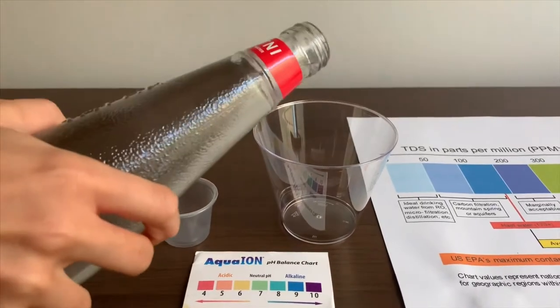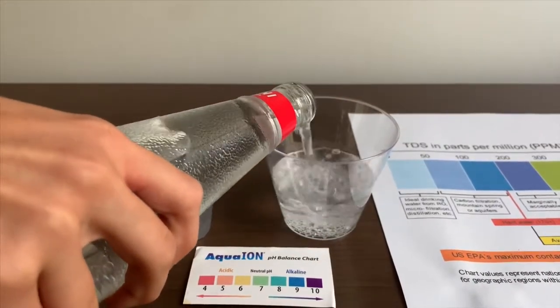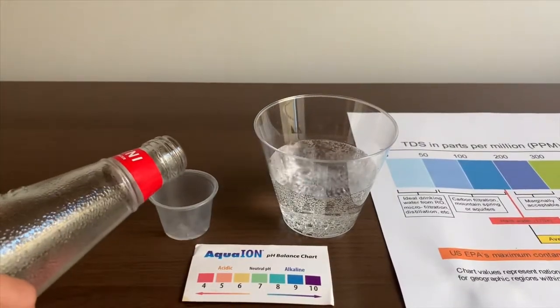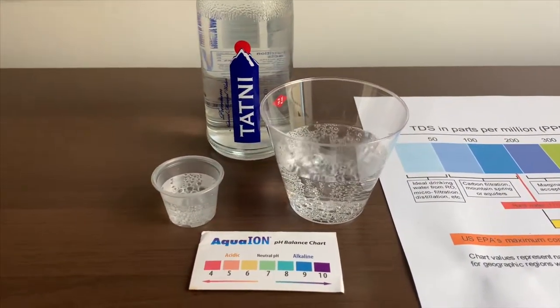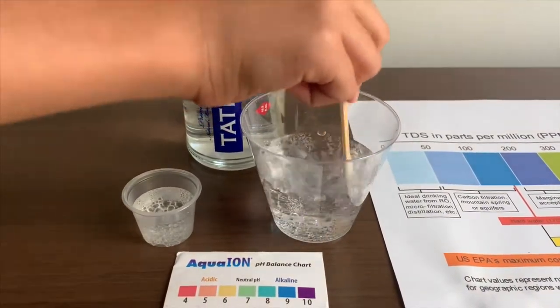Let's pour some water in. Let's stir it so we will get a good TDS level.